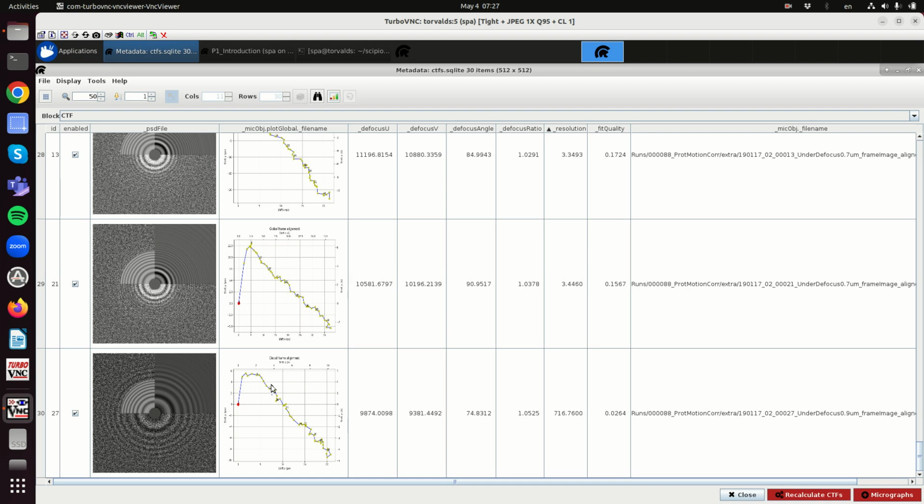Depending on the fraction of the errors, the number of errors can be catastrophically affecting your structure, or maybe just some small nuisance. Okay, so in this very simple analysis, we are not correcting for this kind of stuff. So we let everything go.